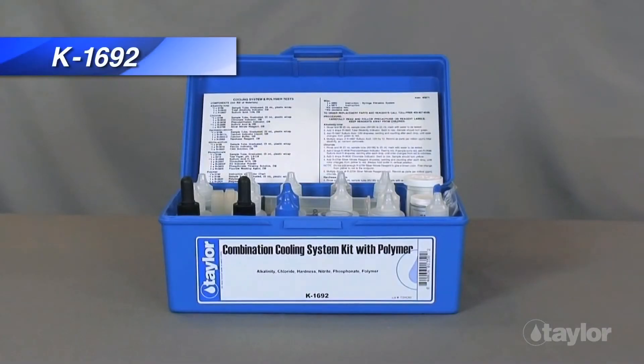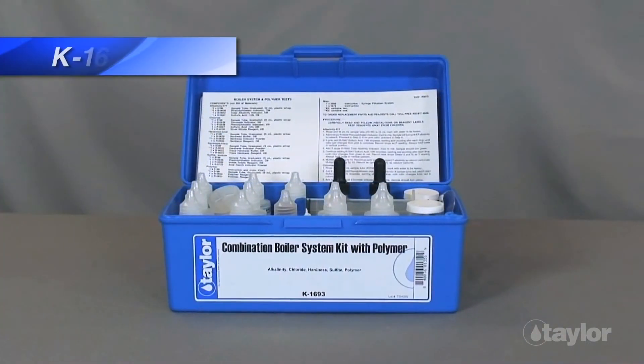The polymer test you just viewed is included in the K1692 combination kit for cooling systems, and the K1693 combination kit for boiler systems.